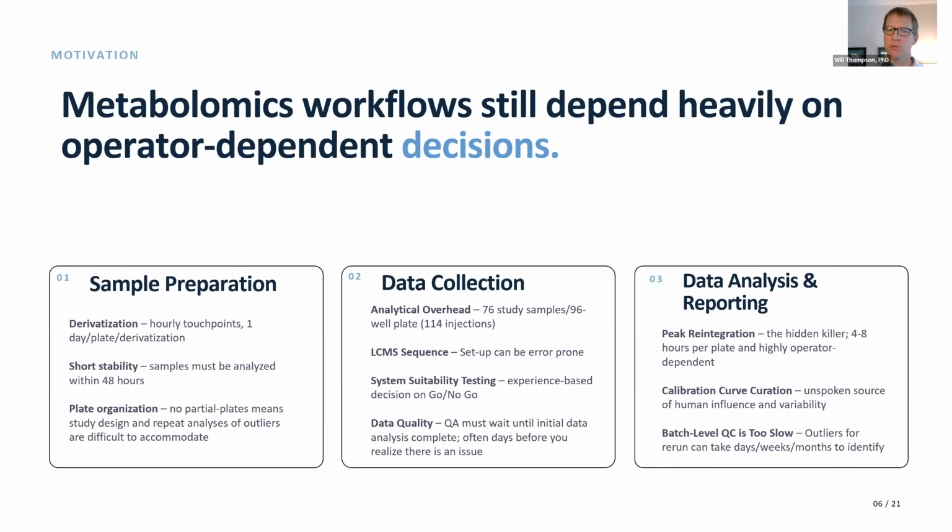But just to highlight a few: sample preparation is typically something where samples need to be derivatized or have very short stability after being prepared, or something seemingly as simple as plate organization and developing the queues. Those are manual touch points, which are error prone.